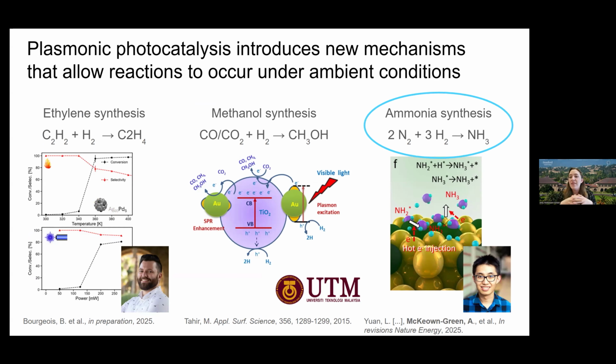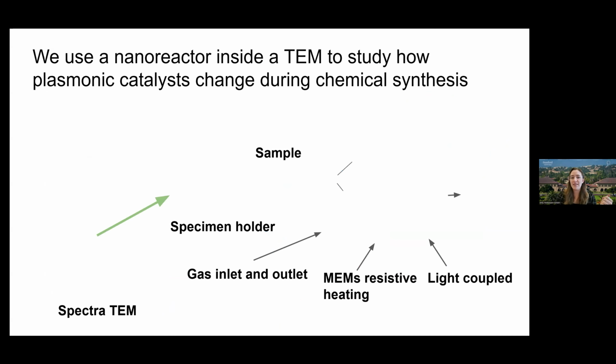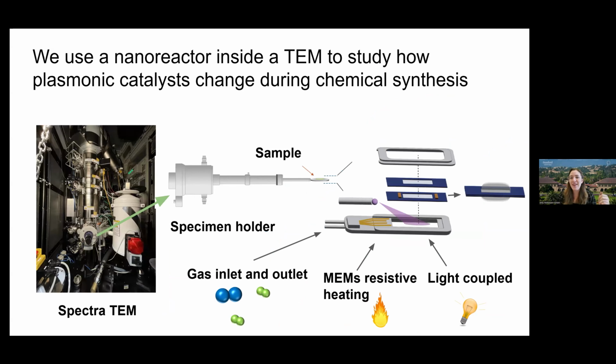My work focuses on ammonia synthesis. I study gold ruthenium solid solution catalysts that have been demonstrated at the reactor scale to produce ammonia under light illumination. However, we throw all these things into a reactor and we don't actually know how the catalysts are transforming or changing their stability during chemical synthesis.